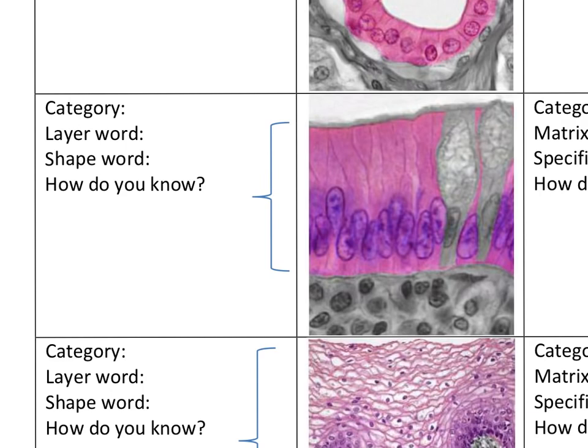All right, if you take a look here, you're going to see nuclei nicely lined up along here. And if you look around these nuclei, you can kind of make out the outline of a particular cell, something like that. At the top, there are little fuzzies. Those fuzzies are referred to as cilia. There is a narrow lumen up here, barely visible, but it's there.